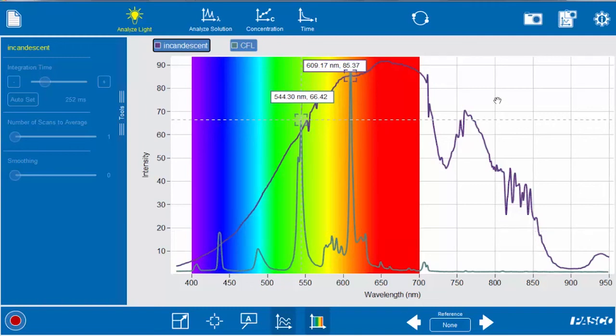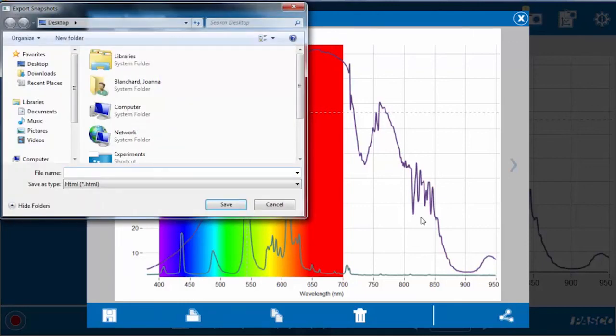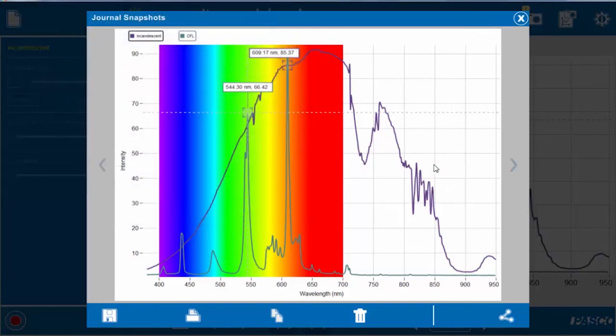So finally if we want to save this data, you can press the camera button up here to take a snapshot and there's a snapshot of the spectrum that we took from the incandescent and the compact fluorescent light. And this button down here allows you to export your snapshot, so we can export it, we can save it as light and just hit save and then you'll have access to it.